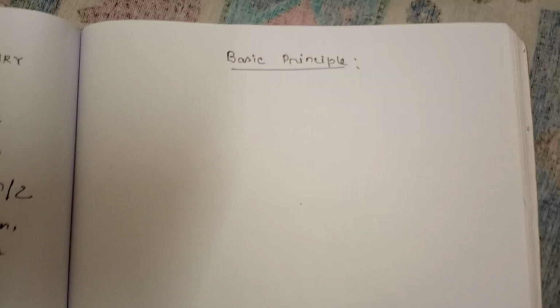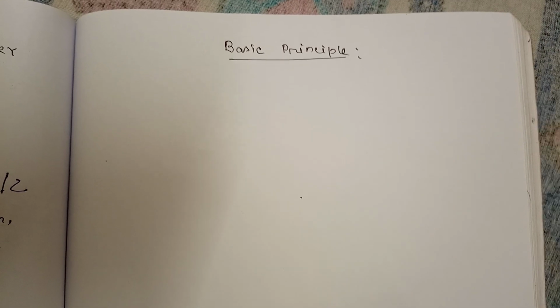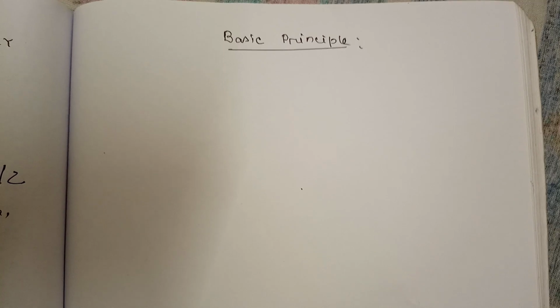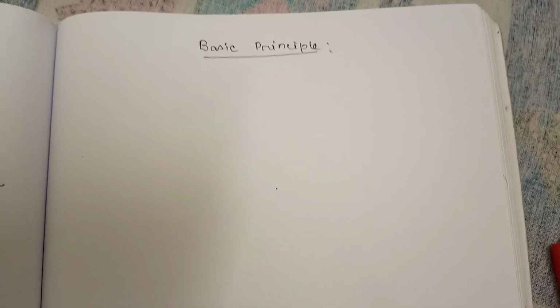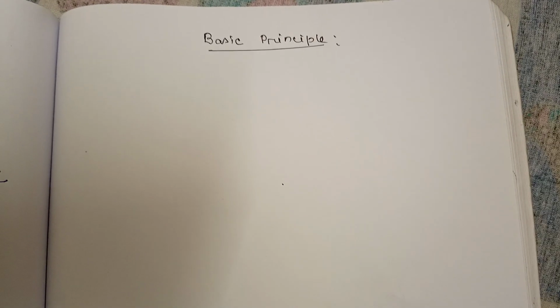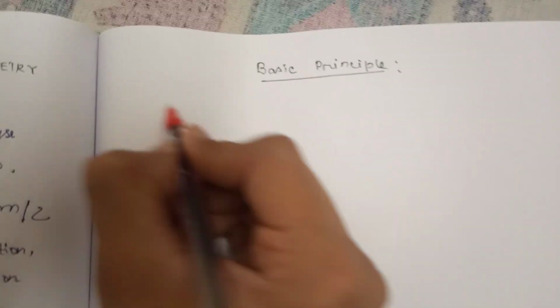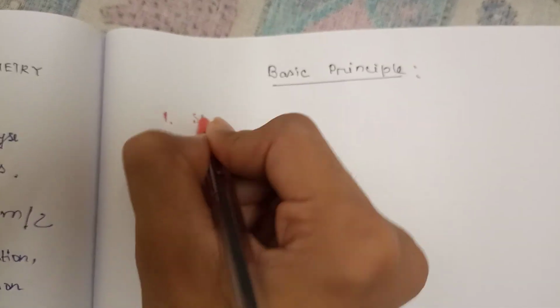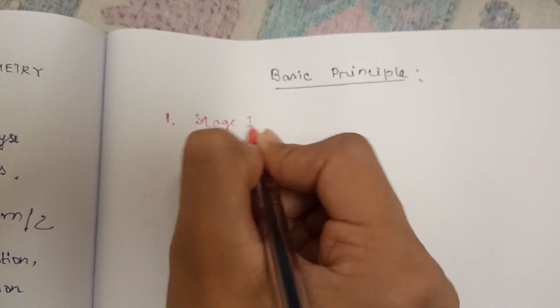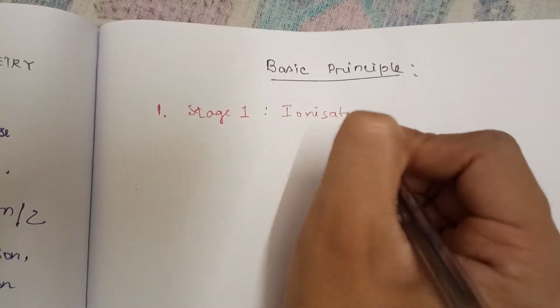Now we'll learn about the basic principle. Now as I said that atoms or the molecules will be measured through their m by z ratio, right? So here are 4 stages of this mass spectrometry. The first stage is ionization.